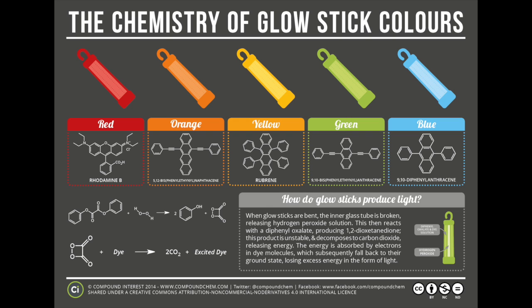Different molecules have different rotational, vibrational, and electronic energy levels that are all quantized, meaning the molecules have discrete energy levels that only absorb electromagnetic radiation when the energy of the photon corresponds to the difference in energy between the two states. The energy levels depend on molecular composition, molecular shape, bonding, and distribution of electron density within the molecule. Thus, different molecules have different energy levels and absorb different wavelengths of energy.